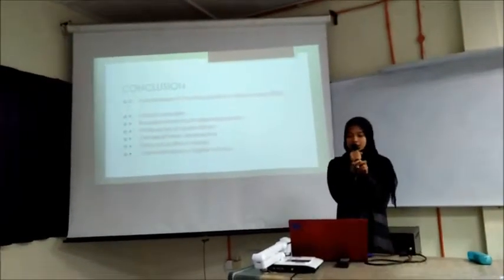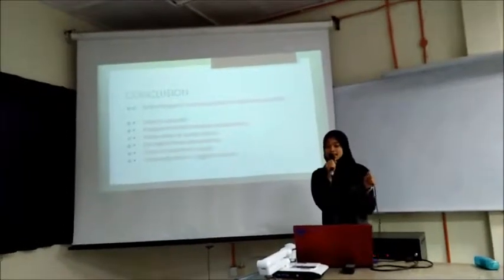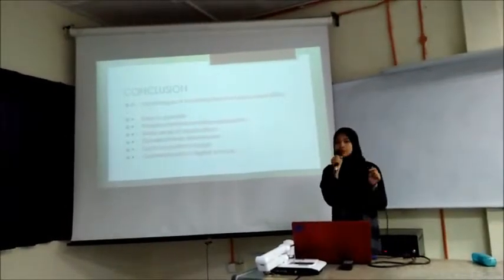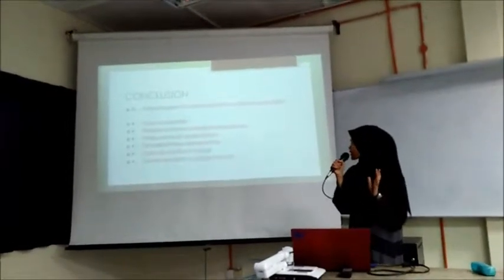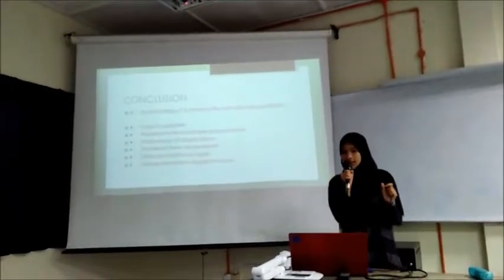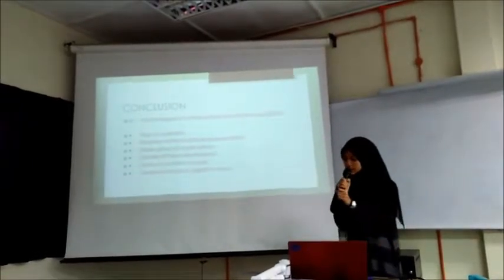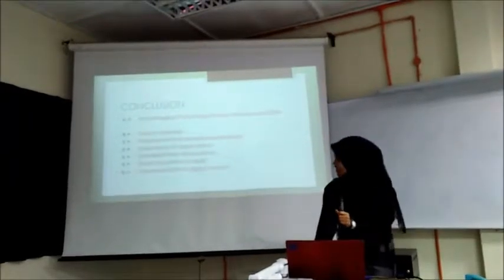Alright, for today's presentation, I would like to continue with the conclusion of scanning electron microscope. Firstly, I will talk about the advantages of scanning electron microscope. First, it is easy to operate with a user-friendly intuitive interface. Second, it requires minimal sample preparation. Third, it has a wide array of applications with detailed three-dimensional imaging. And fourth, data acquisition is rapid, which is less than 5 minutes, and SEMs also generate data in digital format.